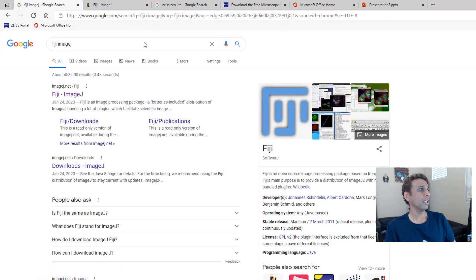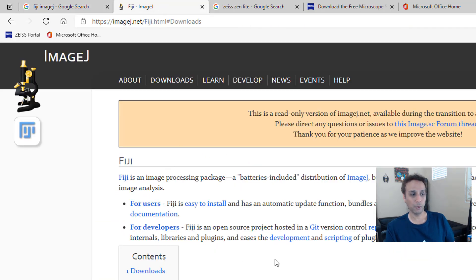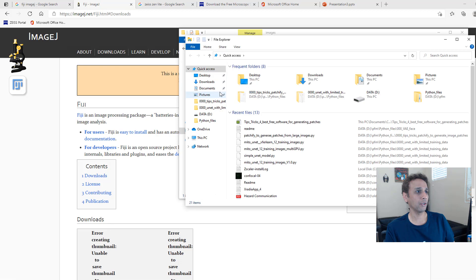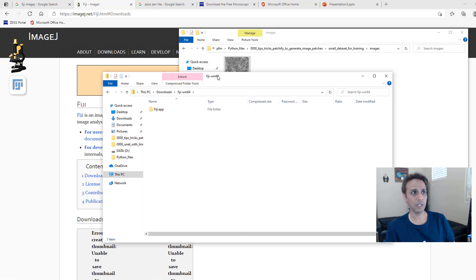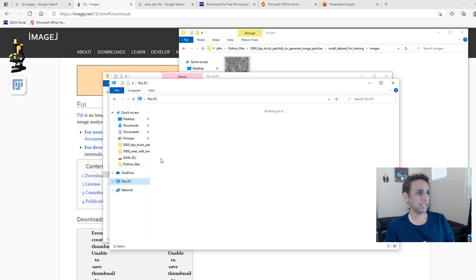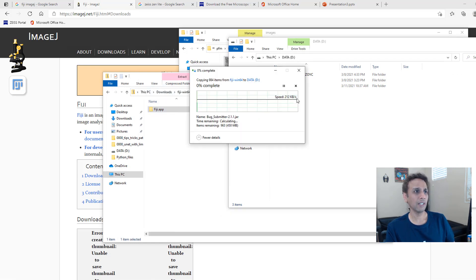Go ahead and Google search for Fiji ImageJ. The download is easy — it downloads as a folder. So if you go there, it just downloads as a folder, and that's exactly what I have done. Let me open another file explorer so you can look at my downloads. Here is Fiji. If I open this, it's a zip folder. I would like to extract this into another folder on my D drive. This is the file — the folder. Let me go ahead and extract it right here. It's not too bulky, but it's like 500 megabytes.